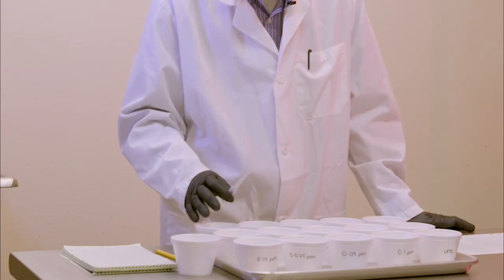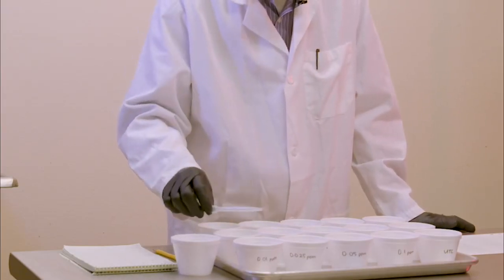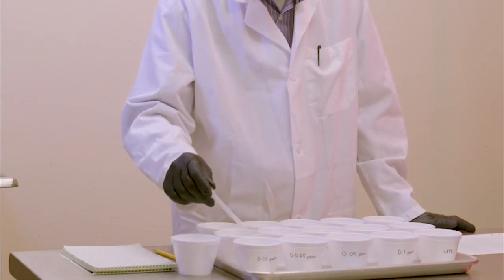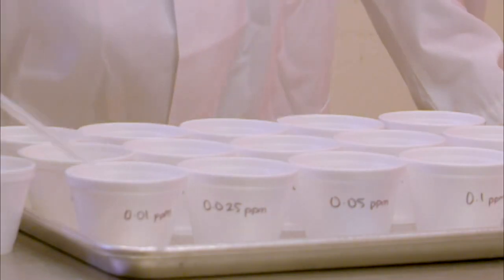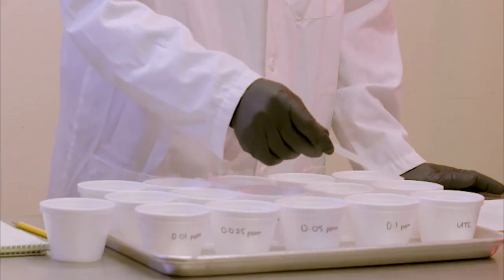You should not see many dead ones in the untreated control. Maybe a couple, 3. If you see more mortality than that, correct for the mortality in the control treatment by using Abbott formula or redo the bioassay. I'd rather redo the bioassay if I have some suspected contamination.